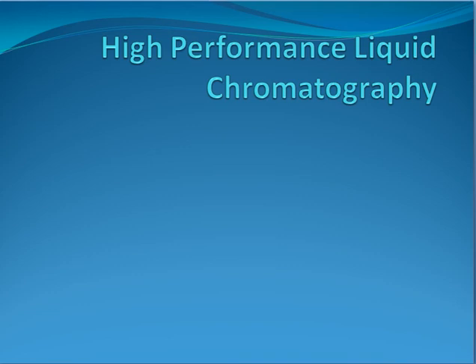Today we are discussing HPLC, that means high performance liquid chromatography. This is one of the chromatography techniques. It is a type of chromatography, a biochemical specialty used for biological samples.